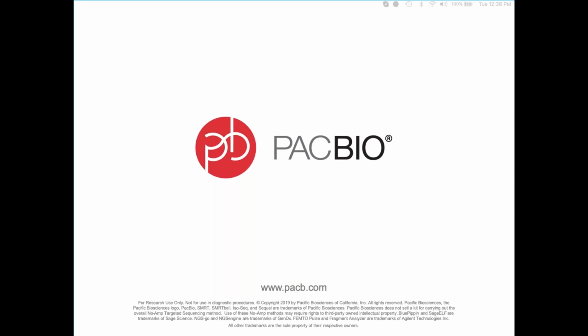Oh, okay. So, got one question, said, I've seen a few genomes assembled using HGAP3 and HGAP4. Does this pipeline work for RS2 data? Yes, it will work with RS2 data, I believe. So you should be able to go ahead and use it with any older data, generating newer assemblies. But if you do hit any issues with that, again, feel free to reach out to tech support, and we'll help you work through that.